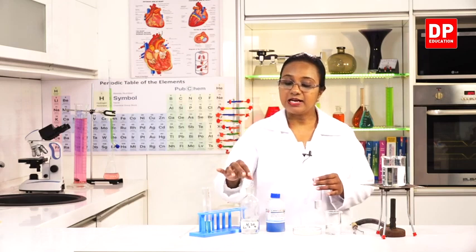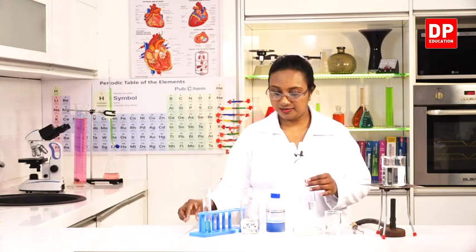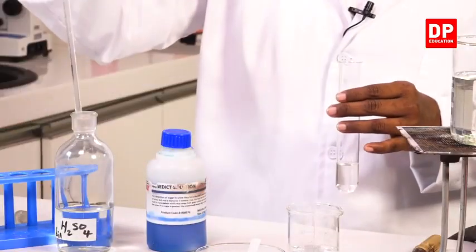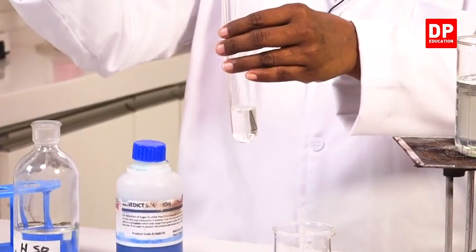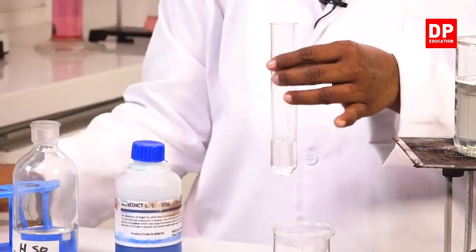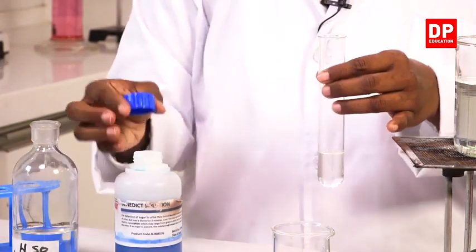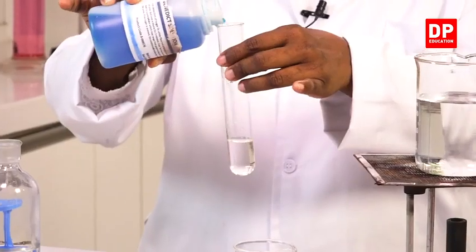Now that the sugar has completely dissolved in water, we will add a few drops of dilute sulfuric acid. Here you can see this is dilute sulfuric acid, and I am going to add a few drops of it to the sucrose solution. And then I will be adding a small amount of Benedict's solution.